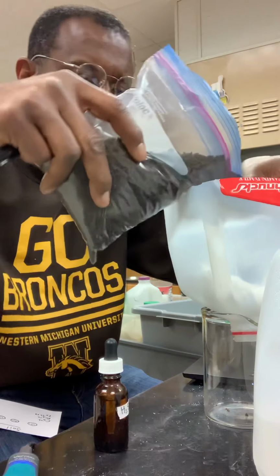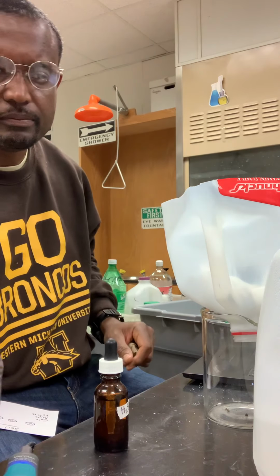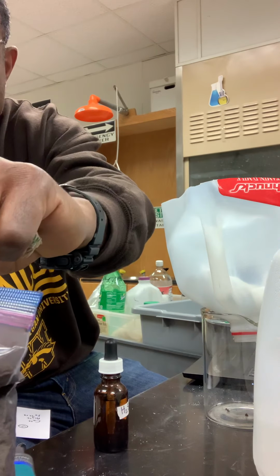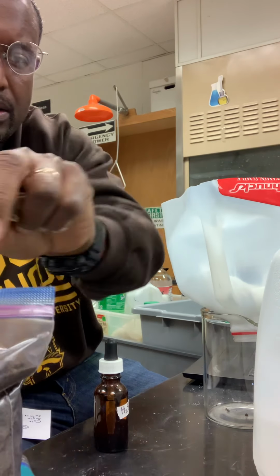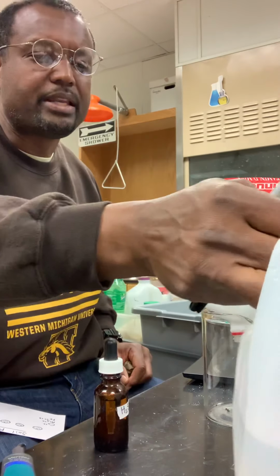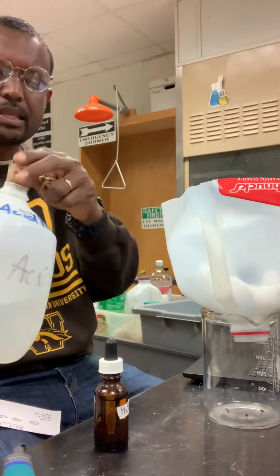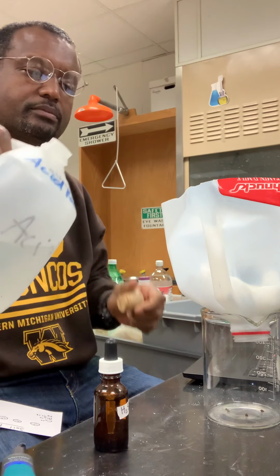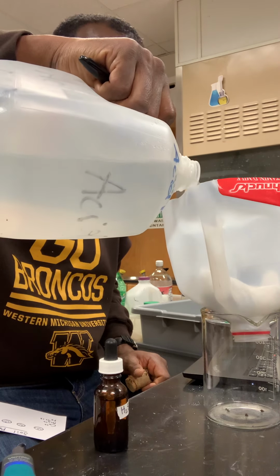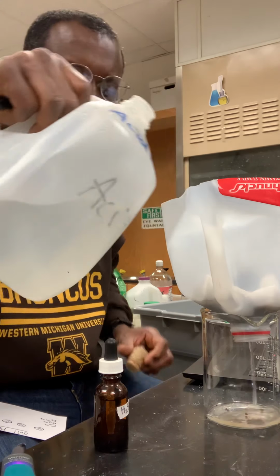Make sure it's there. And then after that, we pour our acid rain on our soil, and then allow it to drain slowly into a beaker below.